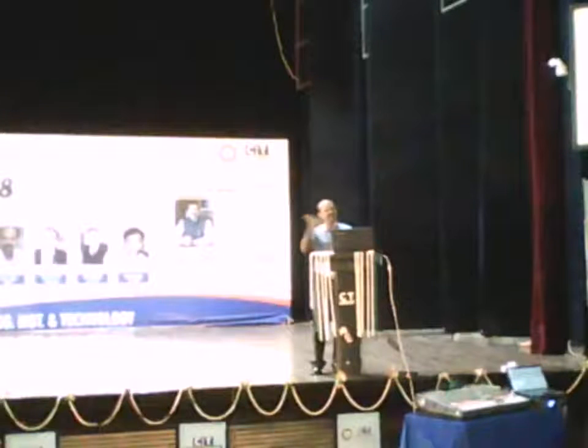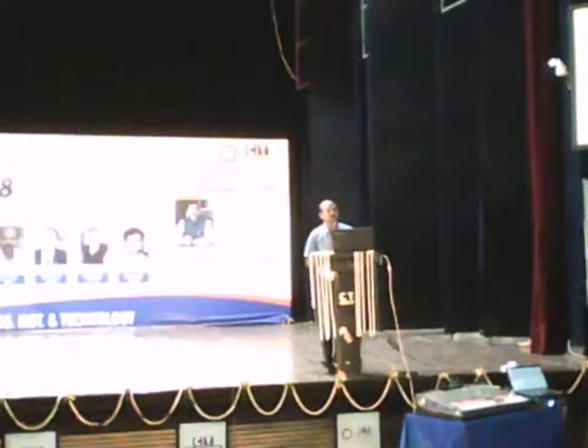You can have different iron, okay? But how do I know which iron it is? Is it 2+ state or 3+ state? For that information, we use X-ray photoelectron spectroscopy. What it does is it takes only the surface. It doesn't go in deep. It only gives the information about the surface. So what information does it give?